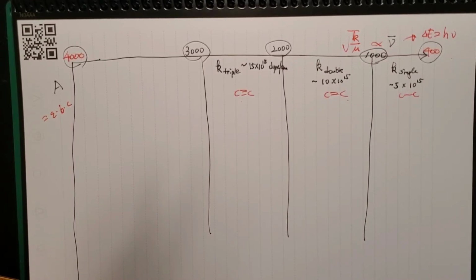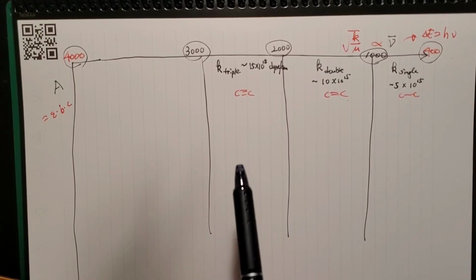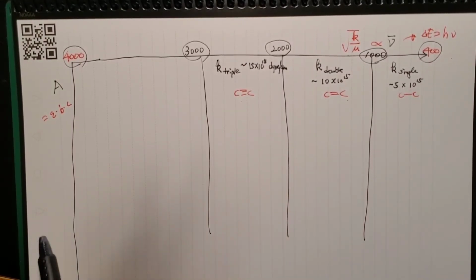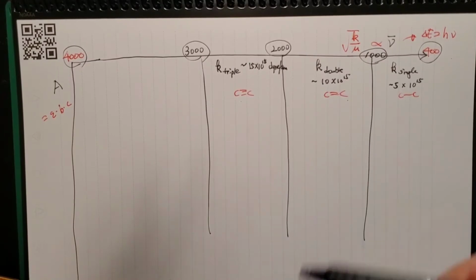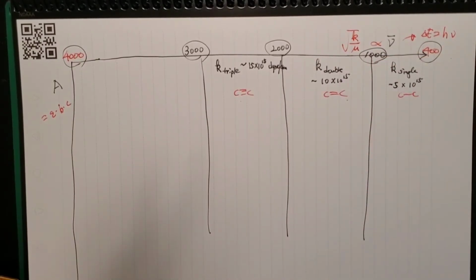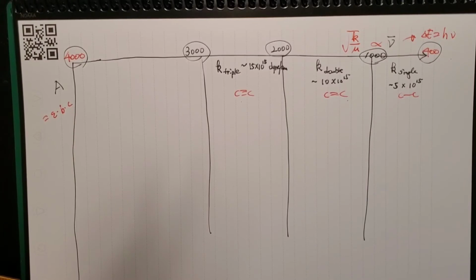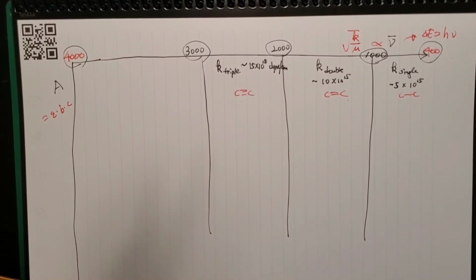So the effect of carbon becoming nitrogen, becoming oxygen in an SN2 or something doesn't affect the frequency that much, though that may change the polarity and the intensity. So you can say, oh, I got the substitution because the intensity of the signal changed, though the signal appears at around the same area.